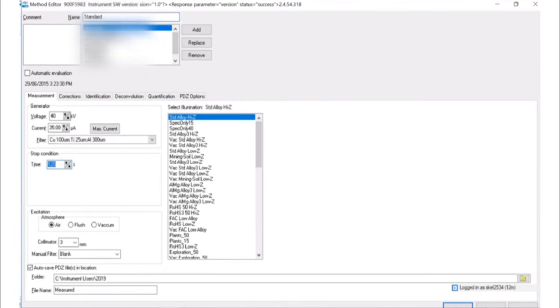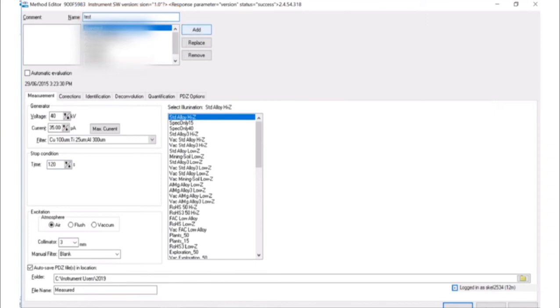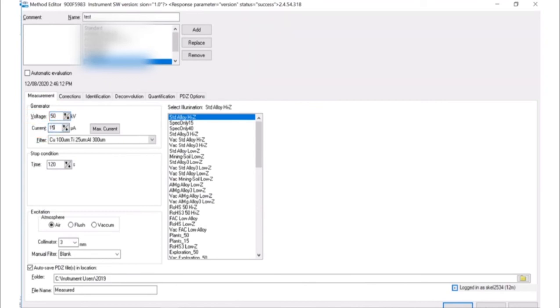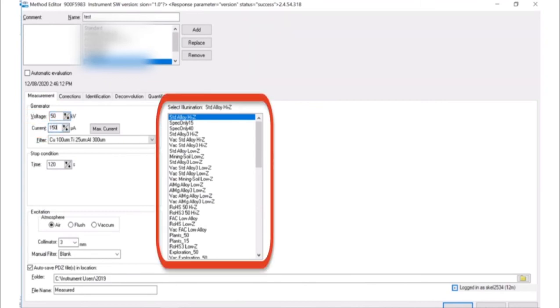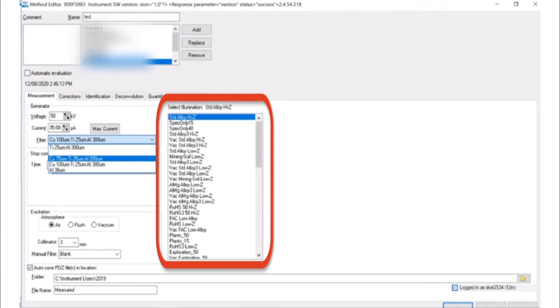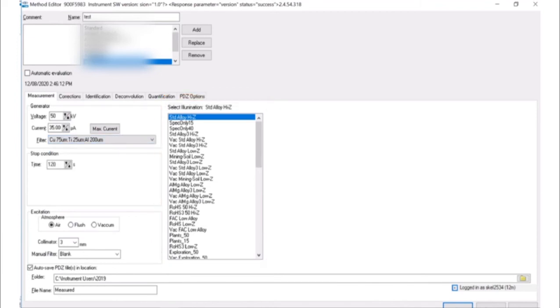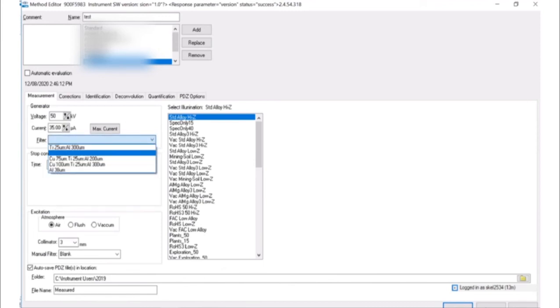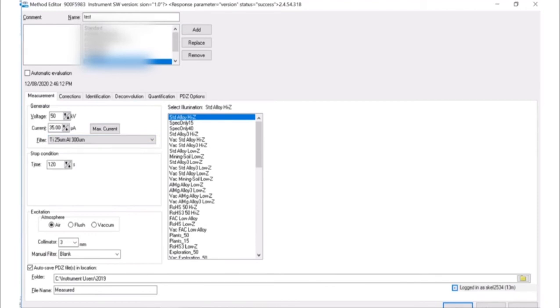You can select an existing method or create a new method. To create a new method, type a method name and click add. In the measurement tab, change the voltage and current to the desired values for your experiment. On the right hand side, a list of illuminations will appear with preset voltage and current settings as part of Bruker Factory calibration methods. Although the calibration files are not accessible, the preset tube settings can be a guide for your samples and desired elements.